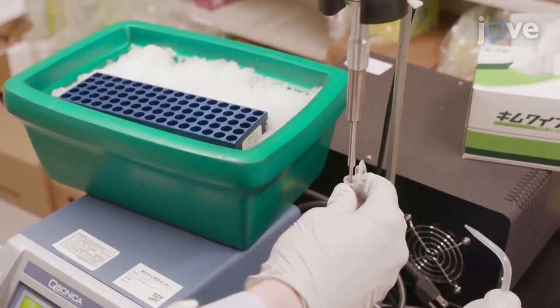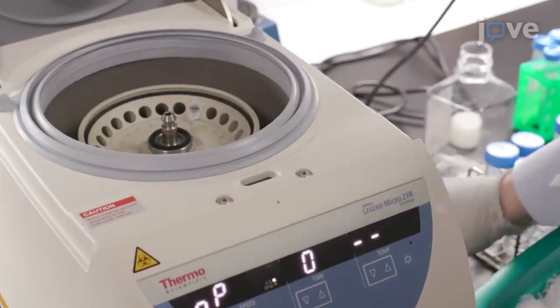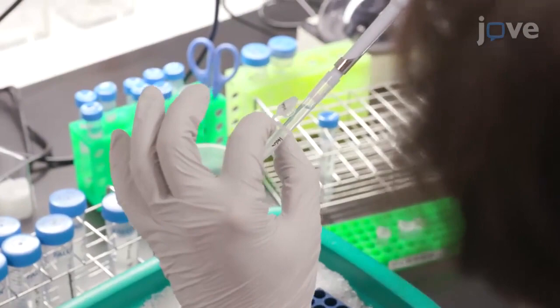Sonicate the sample in a 1.5 milliliter tube at a sonicator amplification of 25% for 10 seconds. Following sonication, centrifuge the sample at 20,400 times gravity for 15 minutes at 4 degrees Celsius.